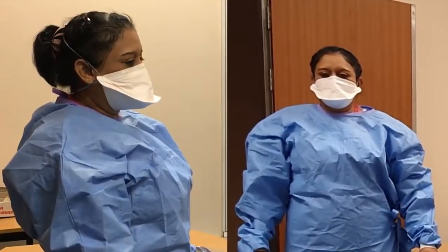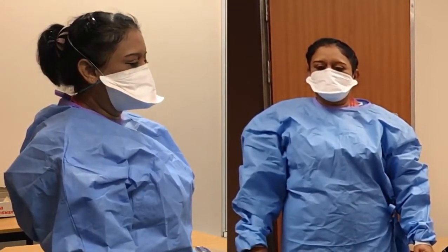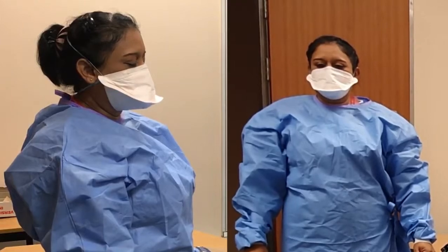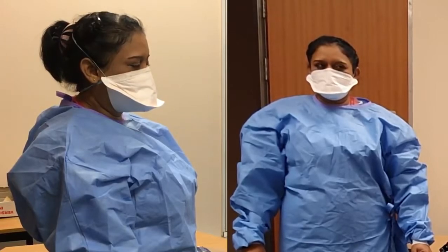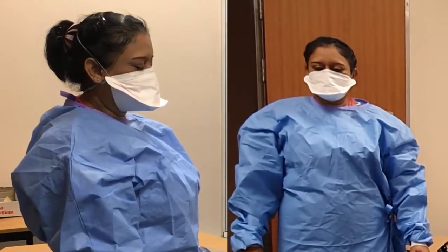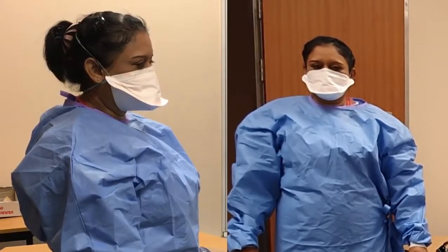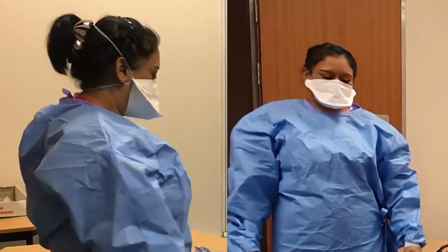Sister Ramlagun is going to breathe out hard and breathe in hard — you can see that mask moving. She's done the fit test which shows that the air is moving through the mask and being filtered, not sneaking in around the sides. If you wear glasses, take your glasses off, put the mask on, then put your glasses back on because otherwise it doesn't fit nicely.